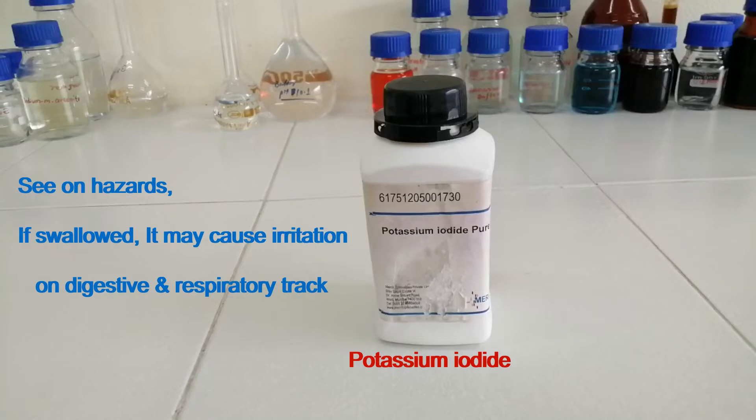This is potassium iodide. See the hazard of this: if swallowed, it may cause irritation on digestive and respiratory tract.